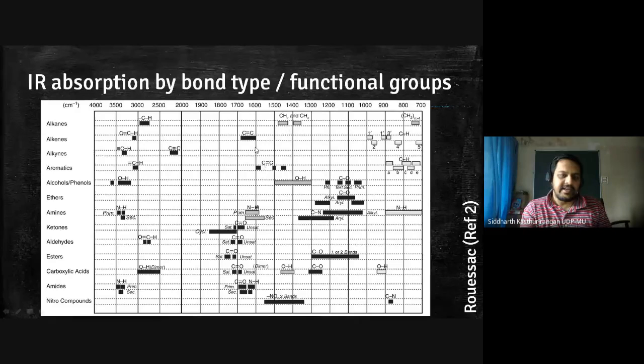And if you see it in alkene, it is here. Aromatic bands are here because in an aromatic compound the double bond is sometimes on one side, sometimes on the other side. So it occurs exactly between alkane and alkene. Between these two, at that region you get the stretching vibration for aromatic compounds.